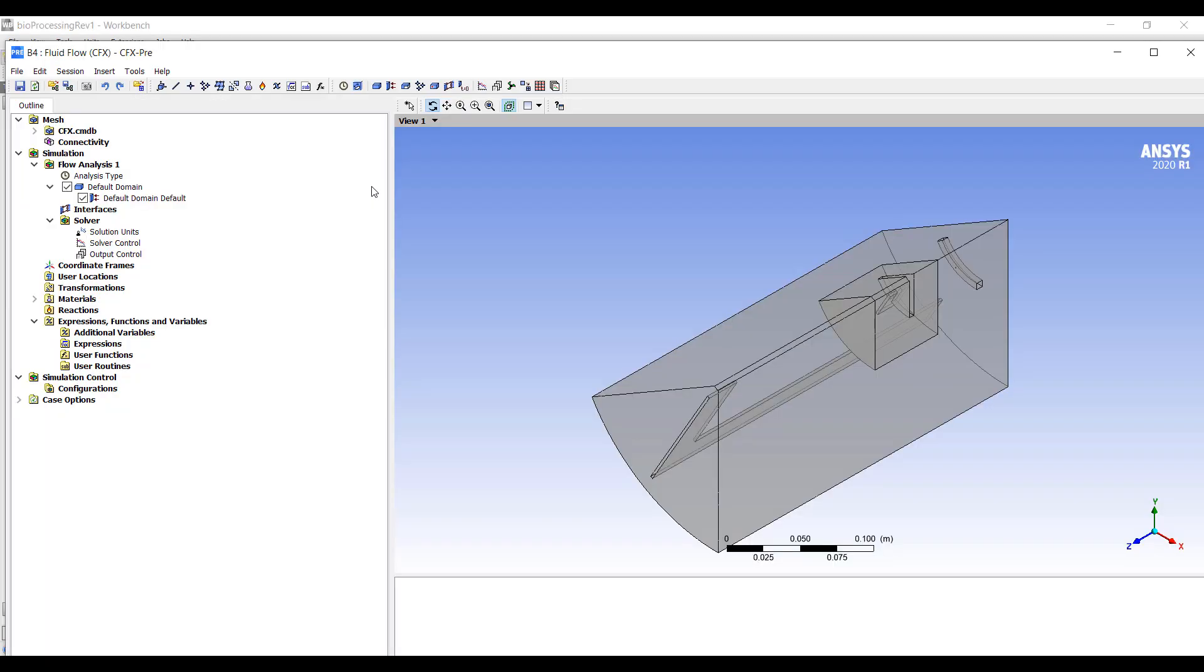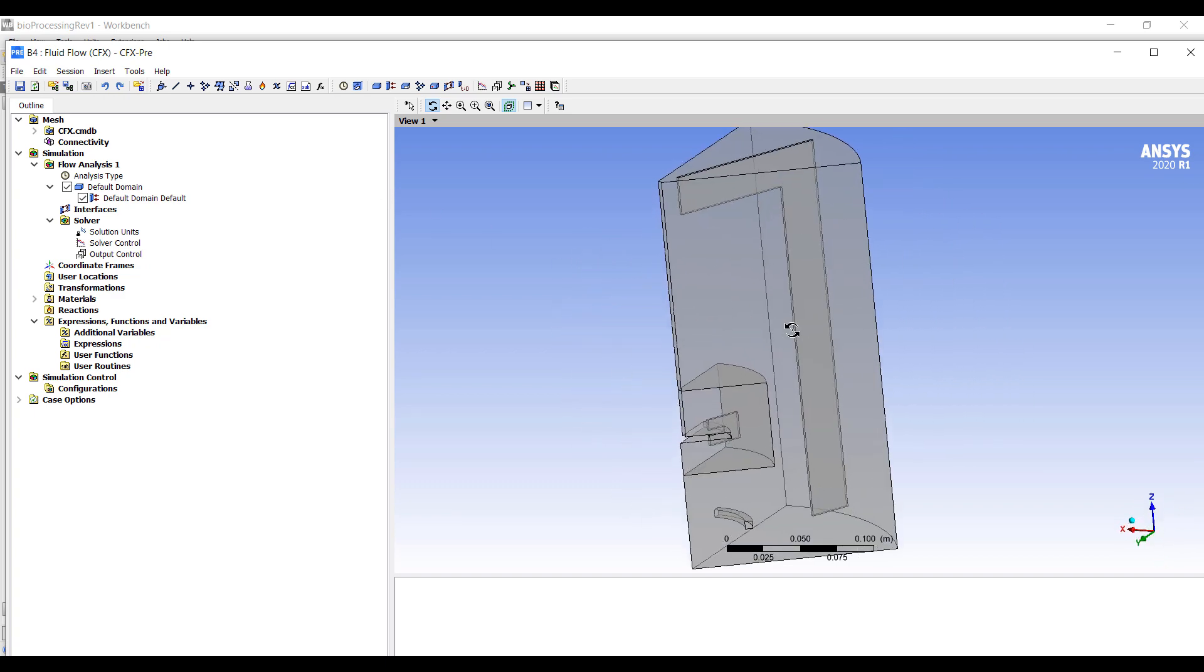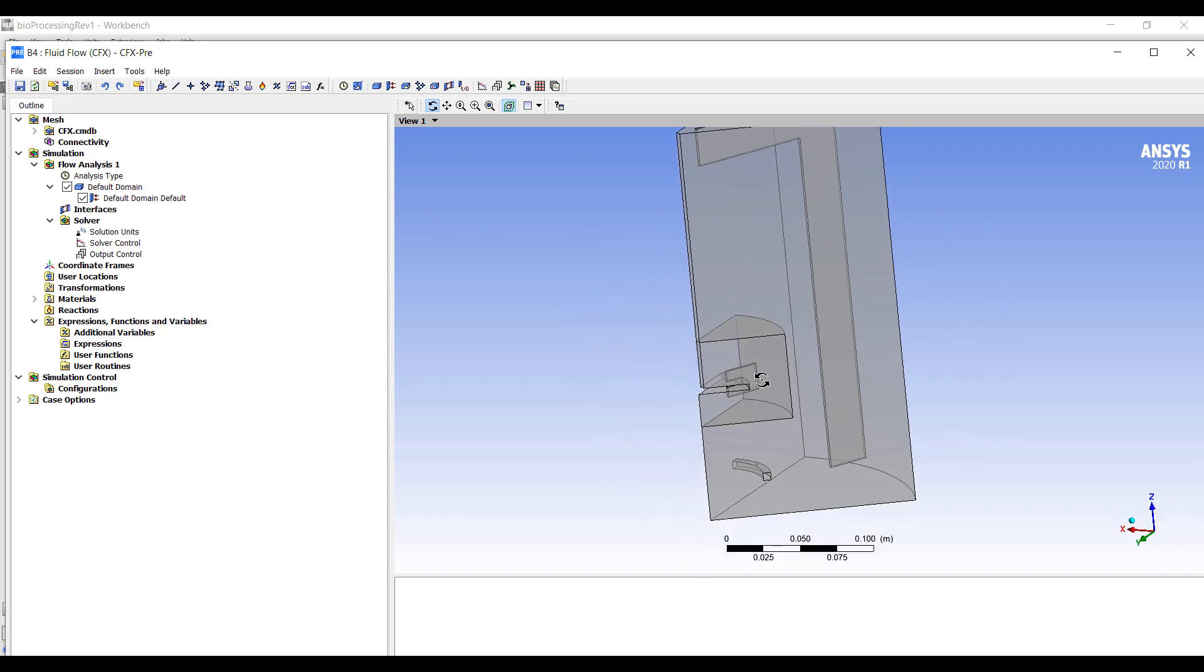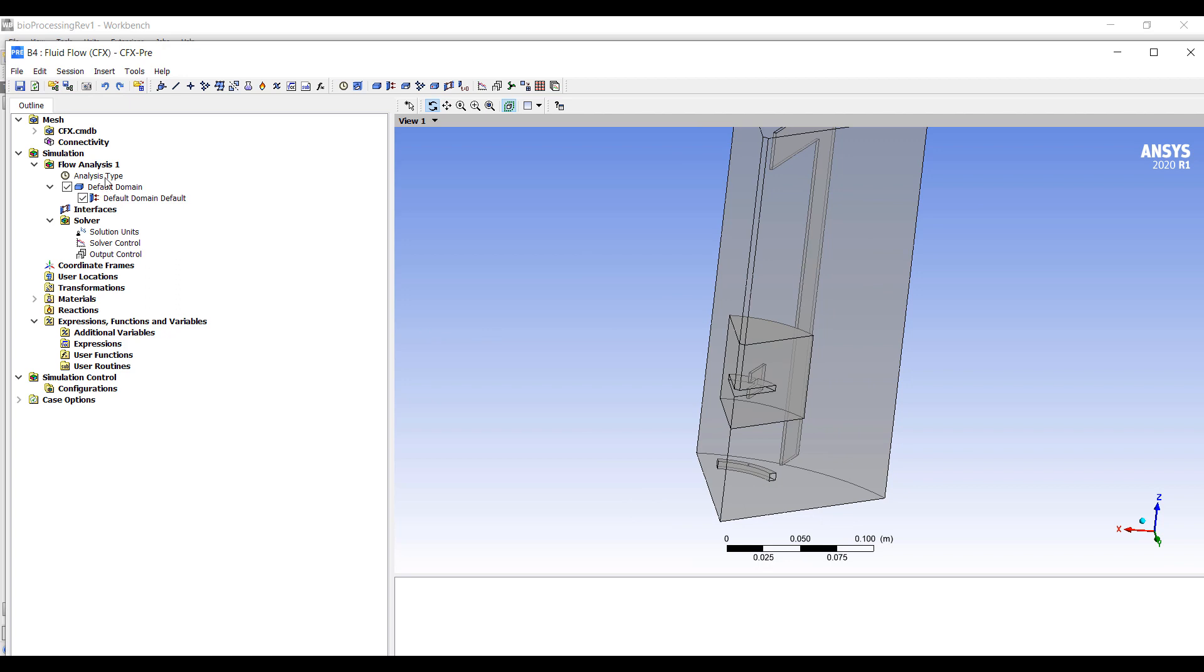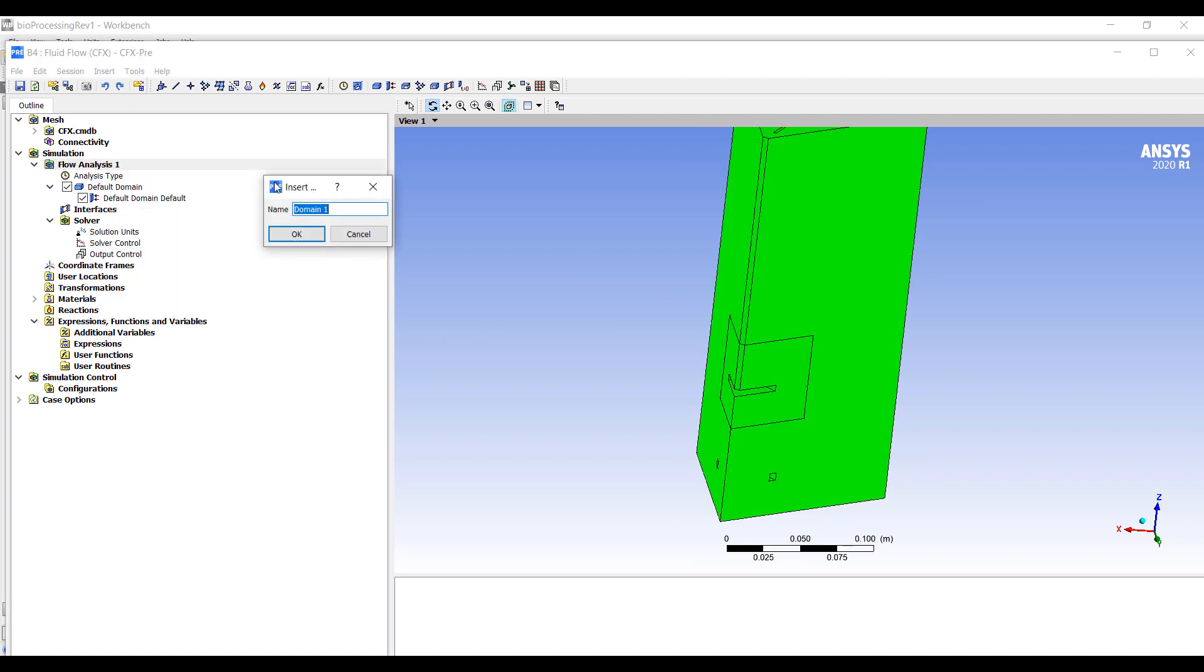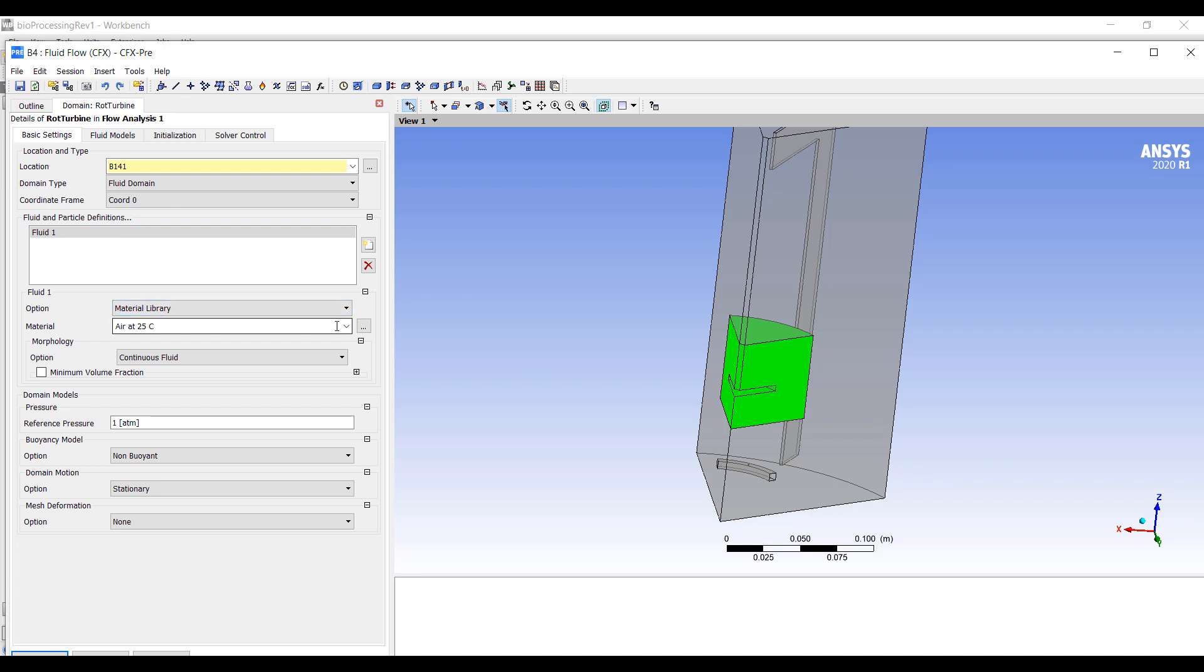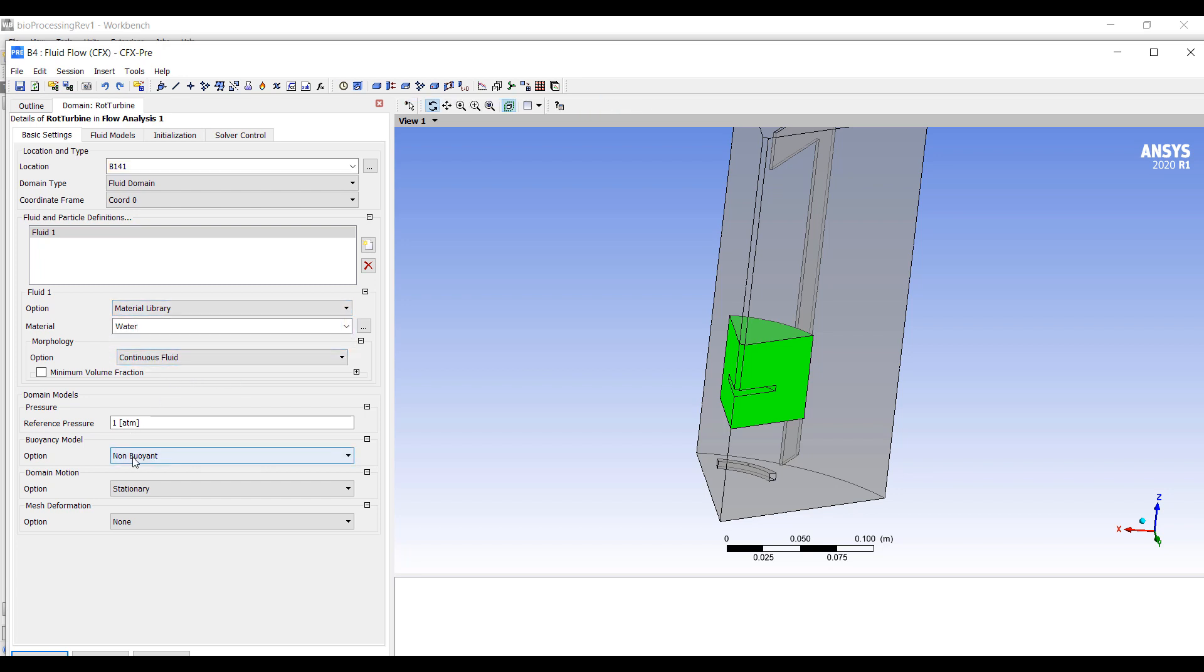So this will be a very simple model. We have a stationary domain, a rotating domain, and periodic boundary. So we're going to first just go down this list, add a domain, call it our turbine, maybe rotating turbine for a little bit more context. That will be the turbine. It will be water, continuous fluid, one atmosphere.